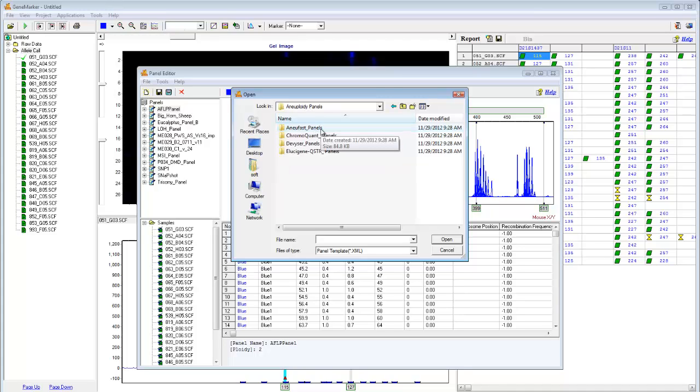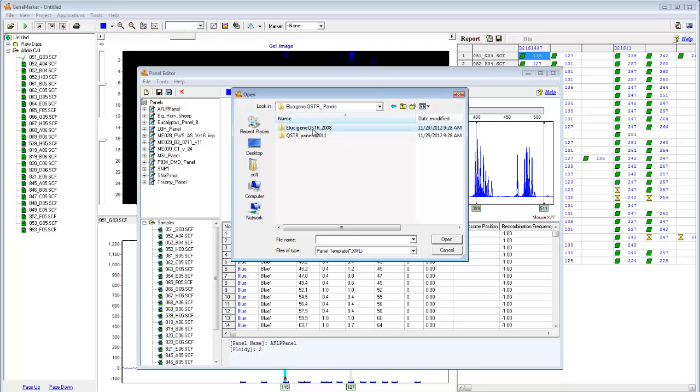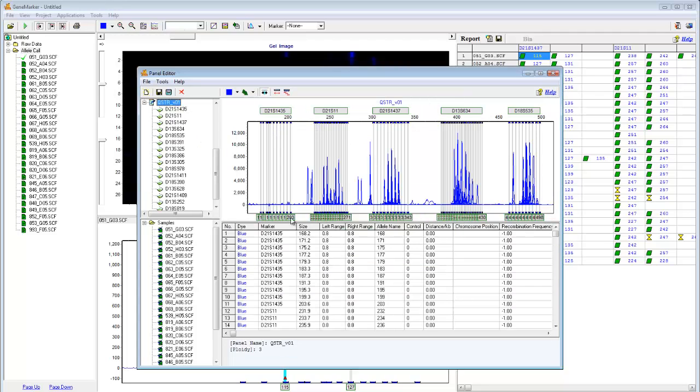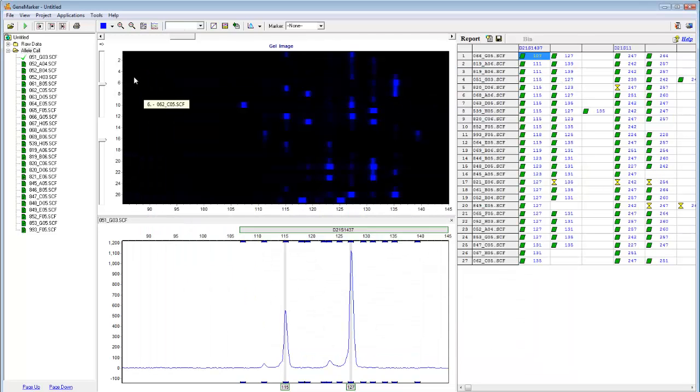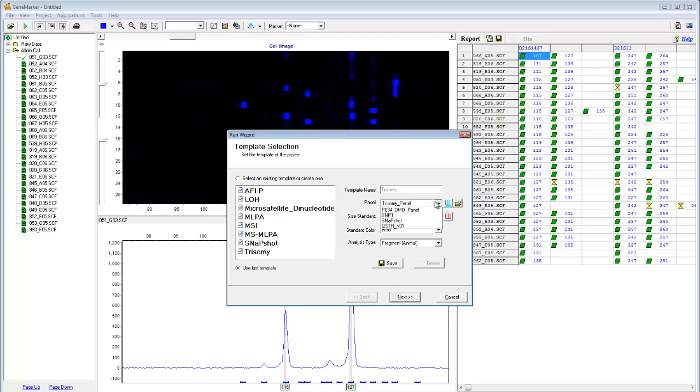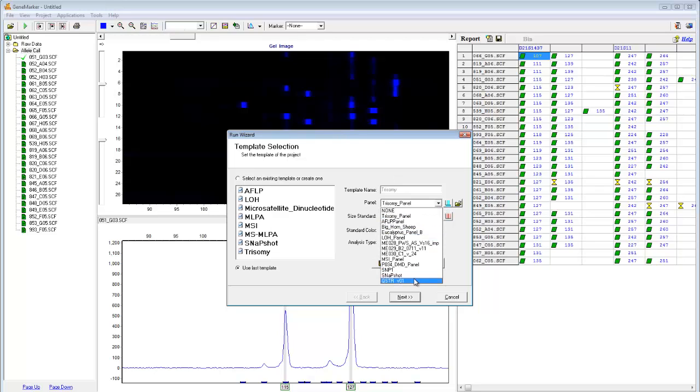Choose a chemistry, and then navigate to the panel of interest. As you can see, this panel has now been imported into the panel editor. If I close out of this and return to the run wizard, I can now see that this panel has been included in my list of usable panels.